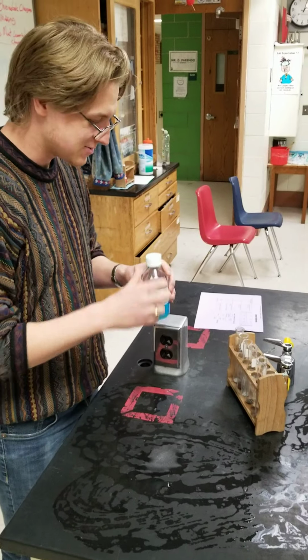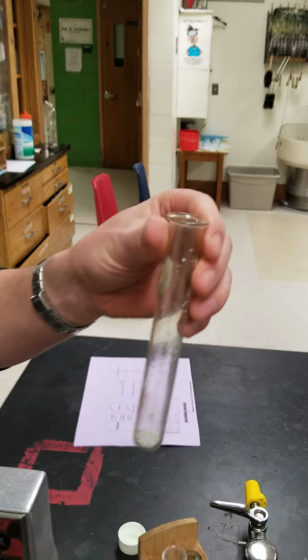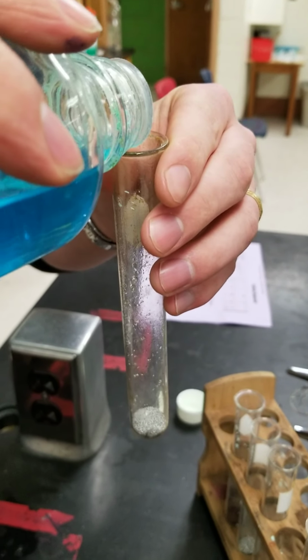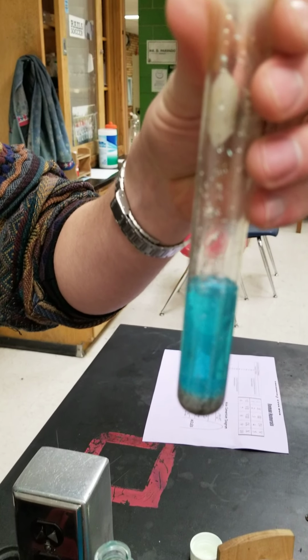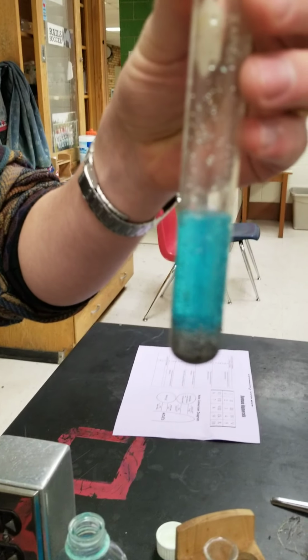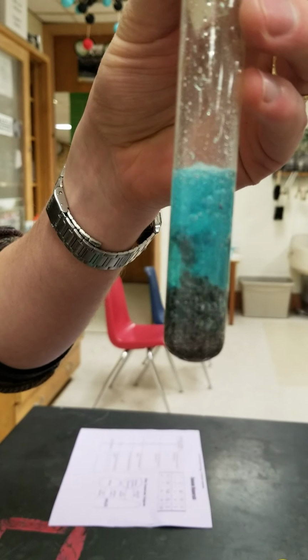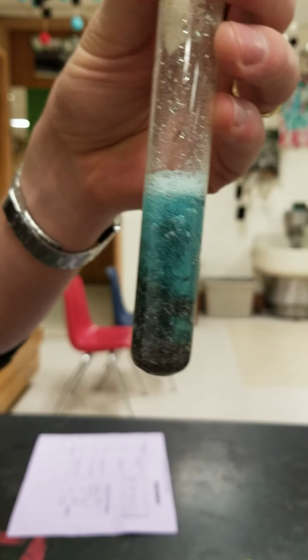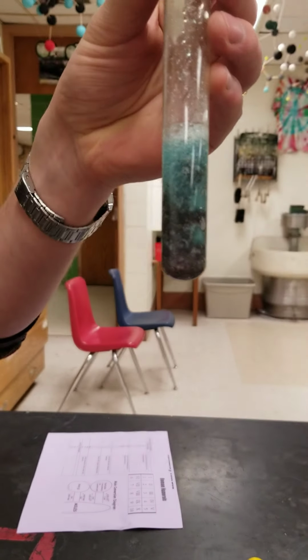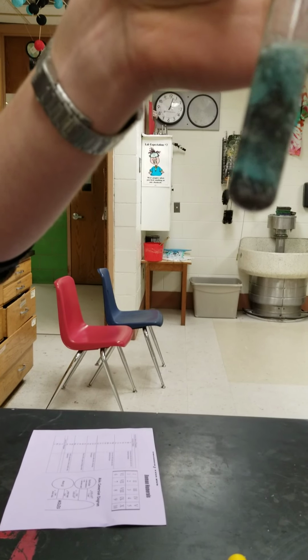So here's our copper 2 chloride. Here's our aluminum. Keep in mind, how do you know if it's a chemical reaction or not? You have a few different things you could think about: looking for color changes, bubbles, heat. Here, you can feel it. Did it feel hot? It felt hot to me. So clearly you can see it's reacting.